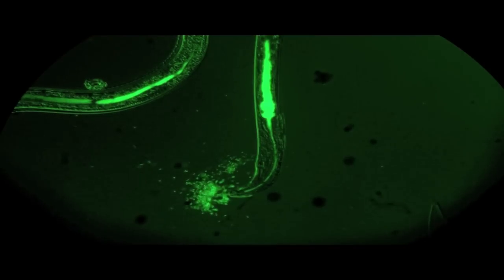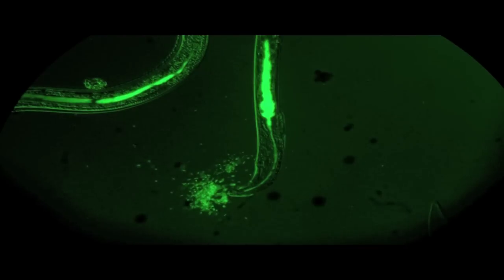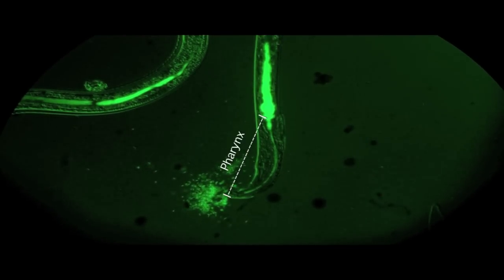And finally, the moment you've been waiting for is to actually see a nematode regurgitating. You can see the bacteria coming from the intestine down through the pharynx and out into the space on the slide.